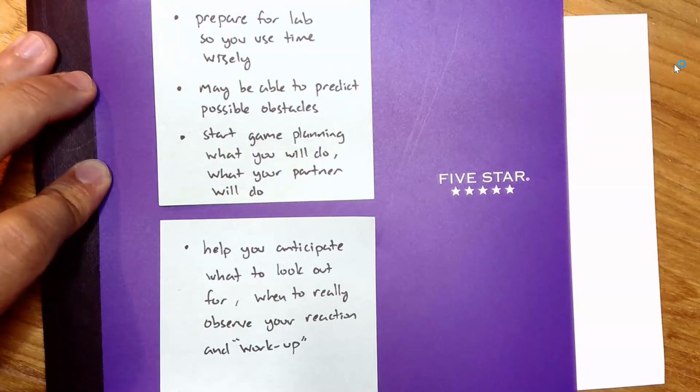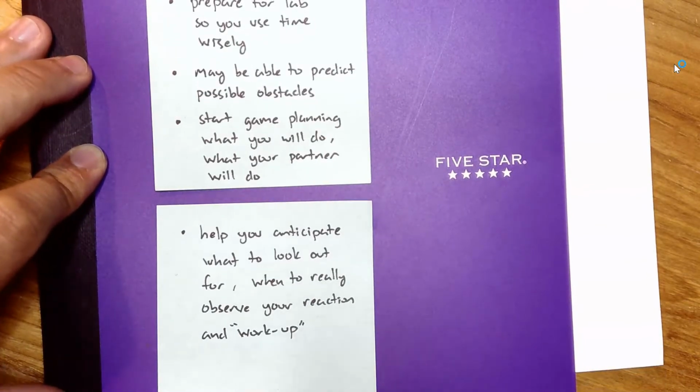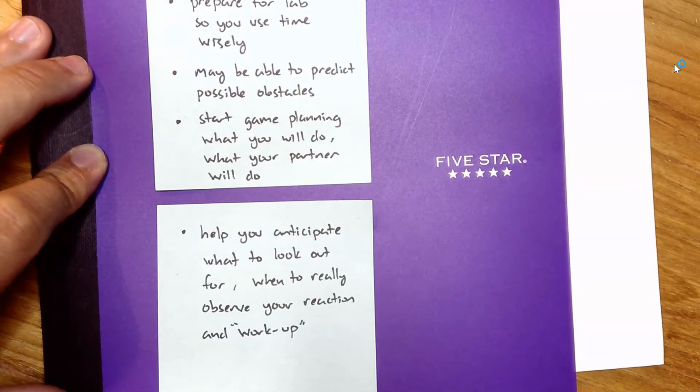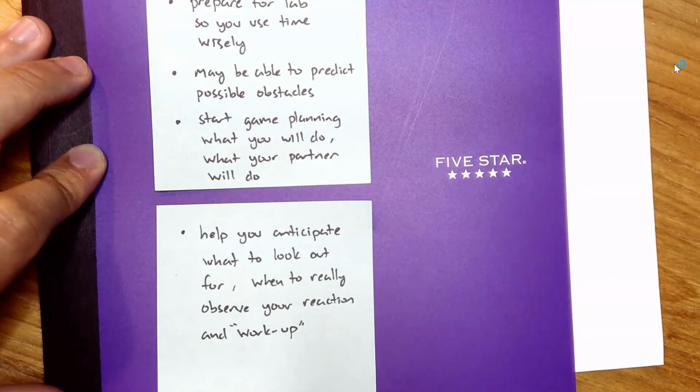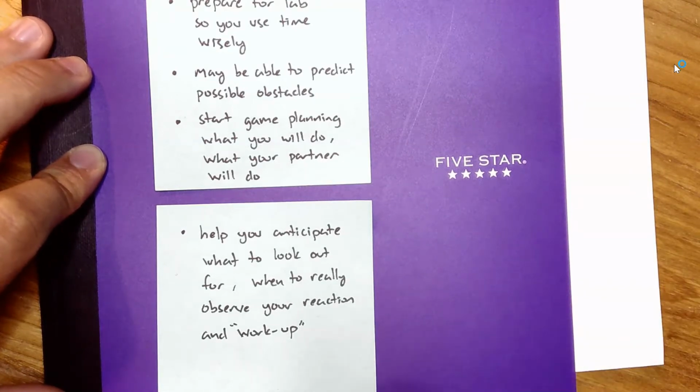Or when do you need to really observe what's happening when you do the workup? A workup is another way to say isolation of the product, or purification. There are other techniques that you'll see as you go through organic chemistry. But after the reaction, you do a workup, and then you do a purification, and then typically characterization and analysis.